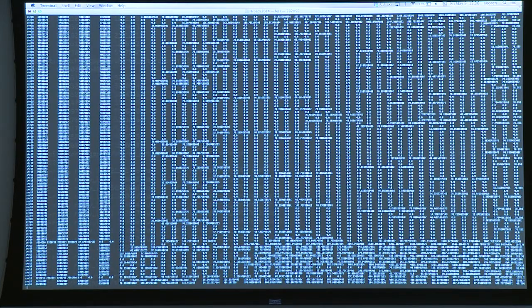And then this is some more points on the chromosome, allowing some further analysis. And then it tells you the score, or how many reads were falling on each of the bins that we were looking at. And it goes on for a lot of them because we said 2,500 in each direction.